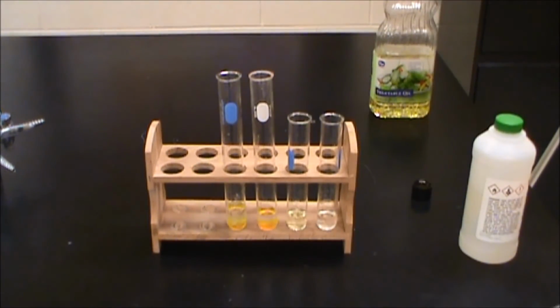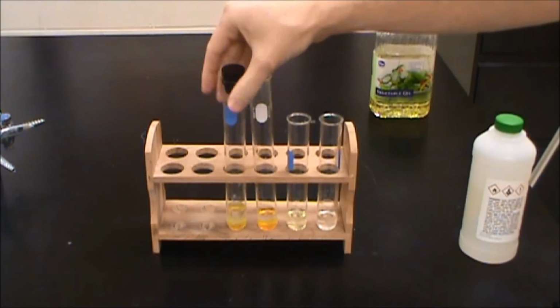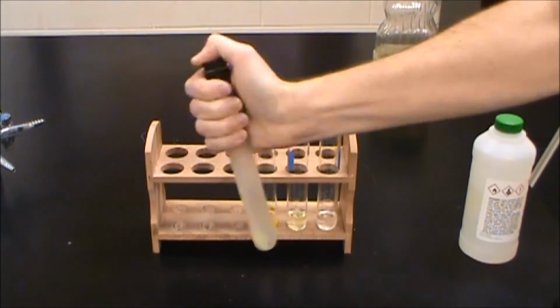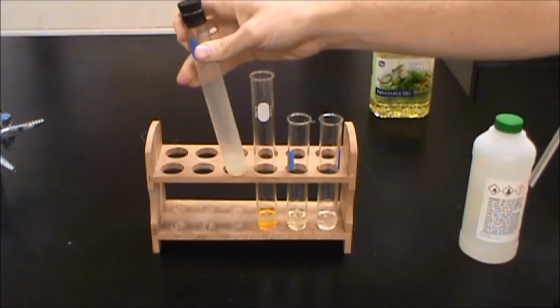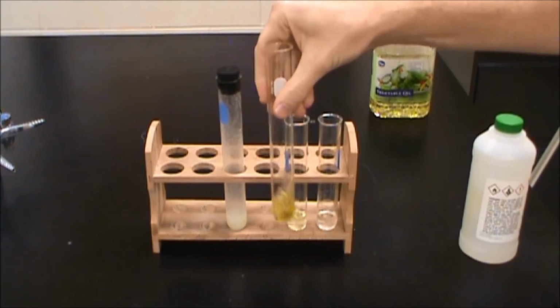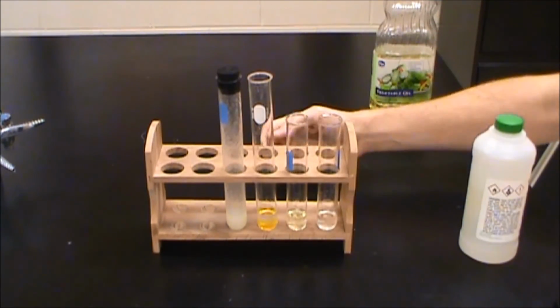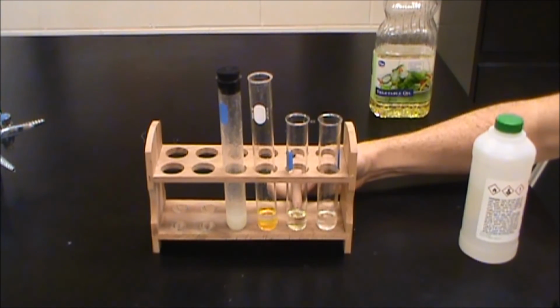And so you can see the presence of the orange color in both, but then what I'm going to do is I'm going to take those and I'm going to shake them. And when I do that, you're going to see this one here. That orange color is now gone. Whereas this one, no matter what I do to shake this, that orange color is going to persist. So you can see now, this one is now different, having reacted with that bromine, than the original point.